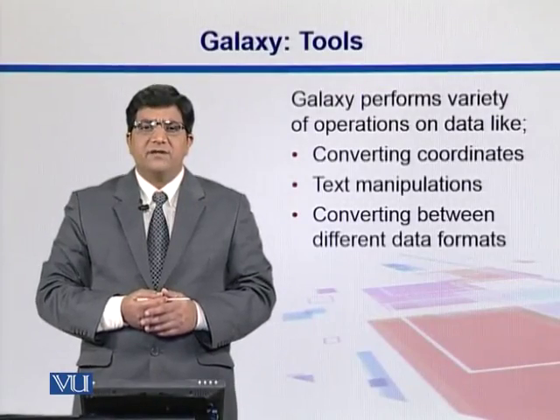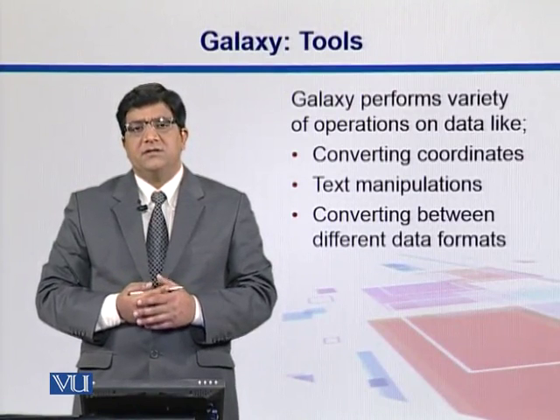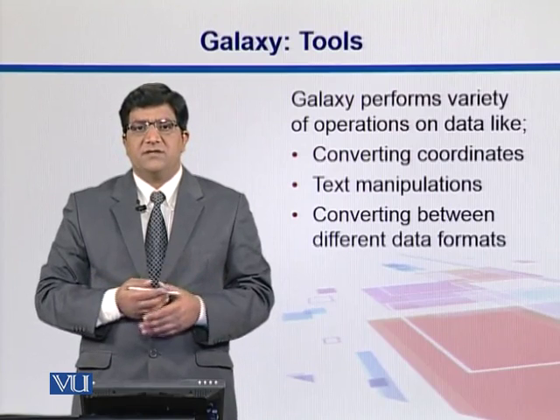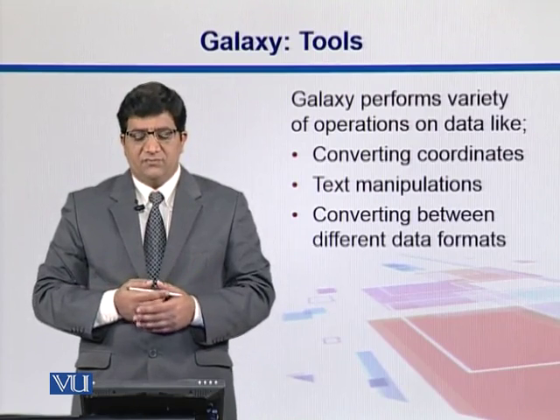Galaxy performs a variety of operations. Obviously, we cannot cover them all in this section. You might want to look into it in detail, and we have some homeworks where you will practice them by yourself and explore what Galaxy can do for you.